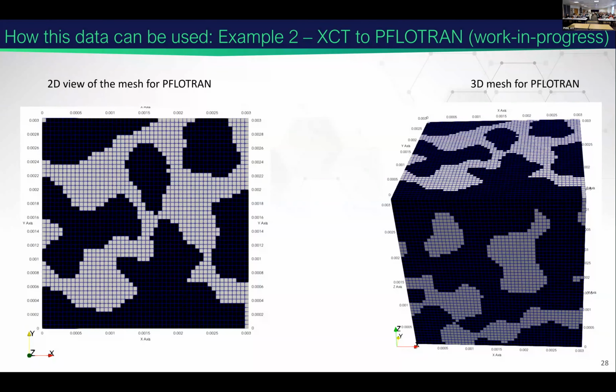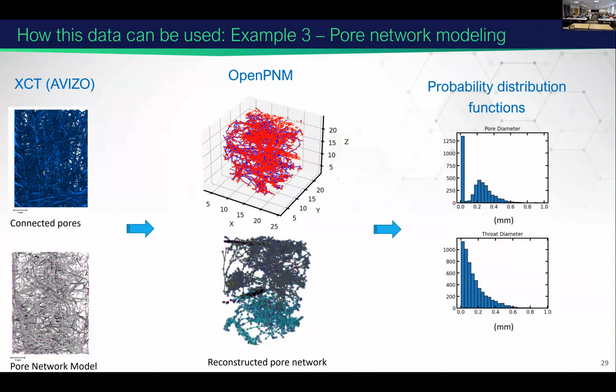So what I'll be showing is a very small part of this. How do we do the segmentation? How do we construct a mesh and visualize this mesh in ParaView tomorrow? So the next step, I will ask Tamas to discuss the pore network model.